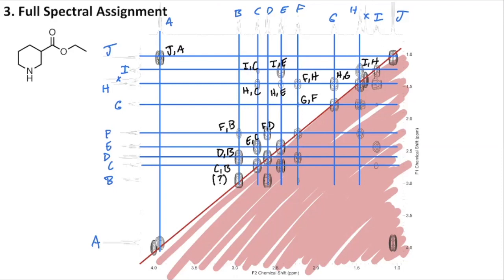Whew. Okay, take a break, blink your eyes a few times. This is a whole lot of things to look at. But given the number of lines and splotches on this page, it seems like it's actually a little bit less than I was initially anticipating coming into this. It does look like a lot of spots and a lot of signals, but again, we're only reading less than half of them.